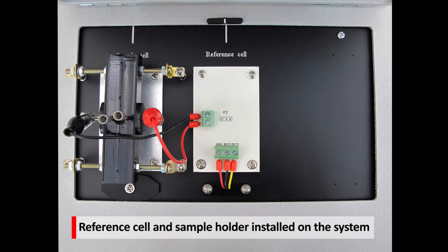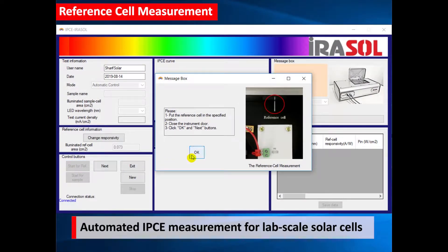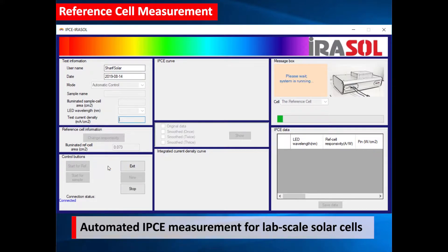The measurement stage consists of both reference cell and sample holder. An easy-to-use software is provided to make easy and fast measurements.